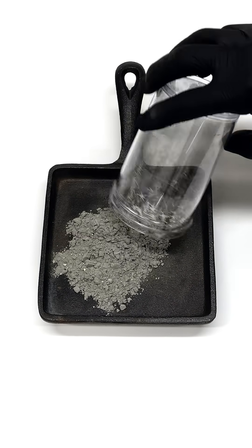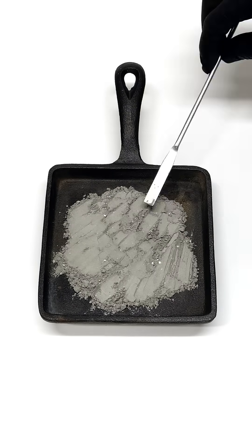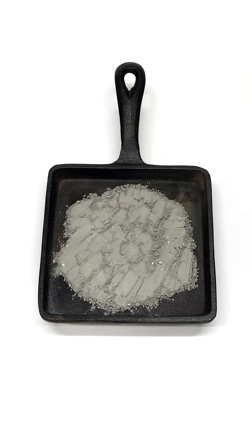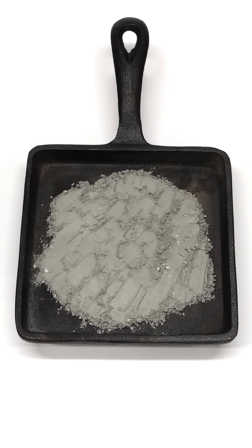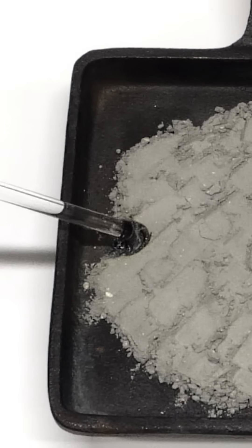It was eventually looking pretty good so I dumped it all out and spread it out as evenly as possible. At this point it's basically ready and I just have to light it on fire. The classic way to do this is by touching it with a hot glass rod, but apparently I didn't heat it up enough and it failed.